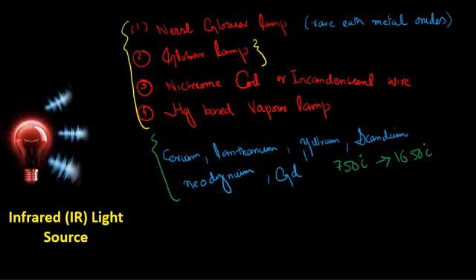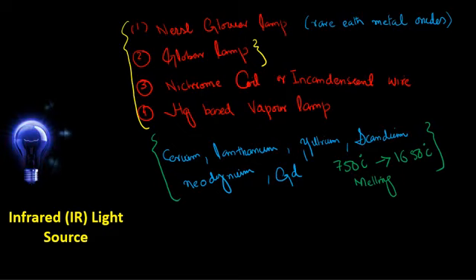So the melting temperature of these rare earth oxides is quite high, and due to this higher melting temperature, these oxides do not interact or cause pollution in the system. Secondly, they just get heated up, and due to their high temperature they generate electromagnetic radiation in the range of infrared radiation, which is 750 nanometer to around 400,000 nanometer.